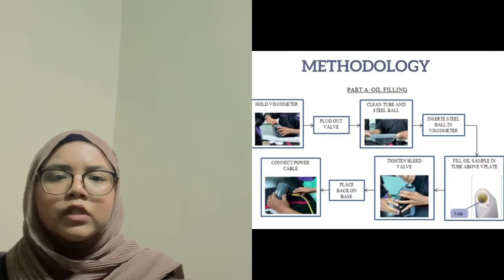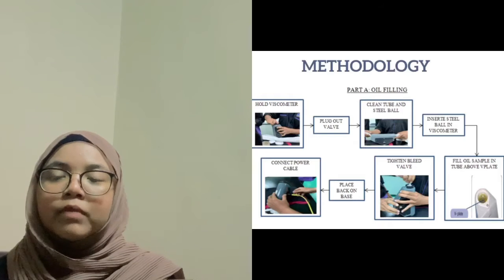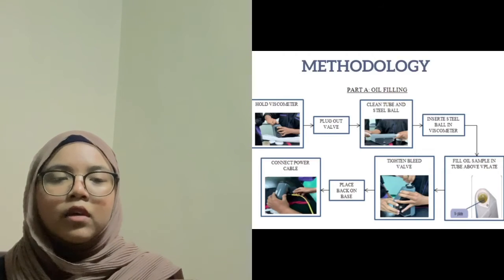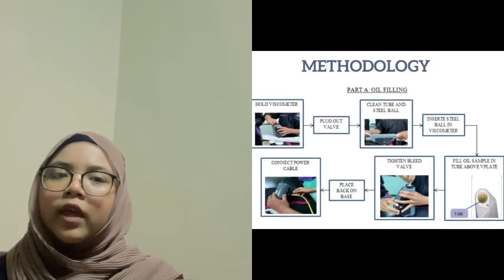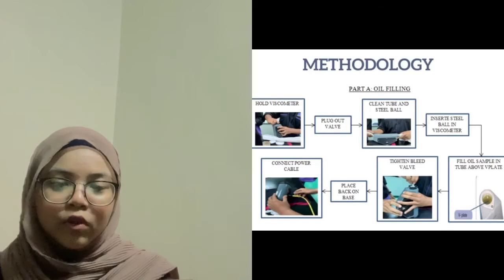clean the viscosity tube and steel ball. They must be cleaned before starting any other process, to clean the ball and the tube from other oil samples used before.